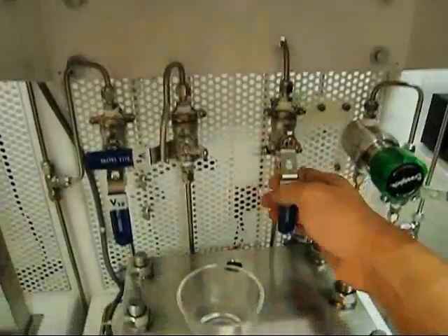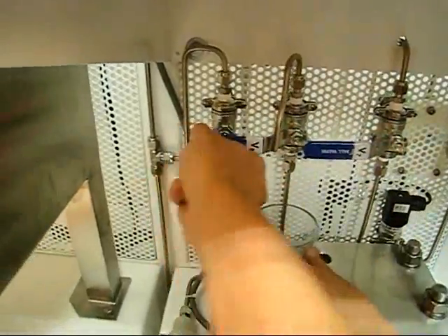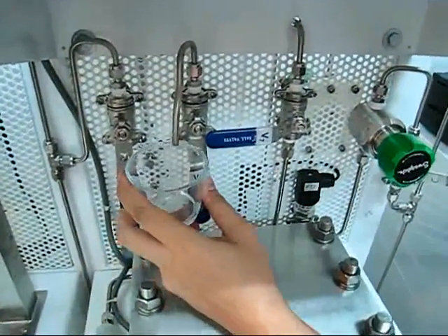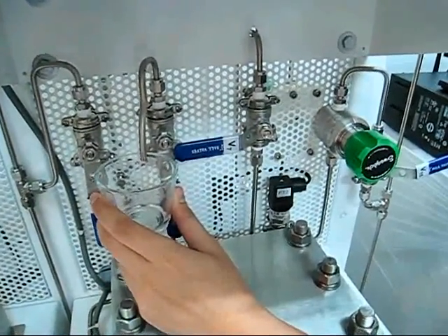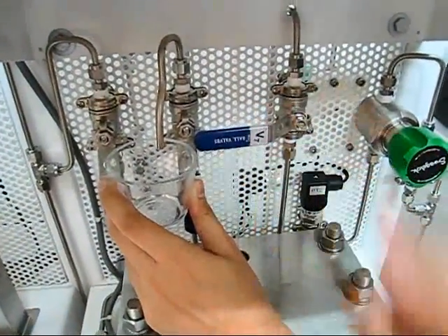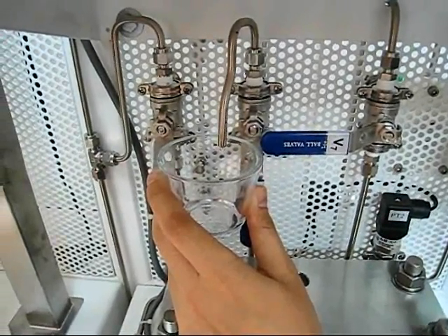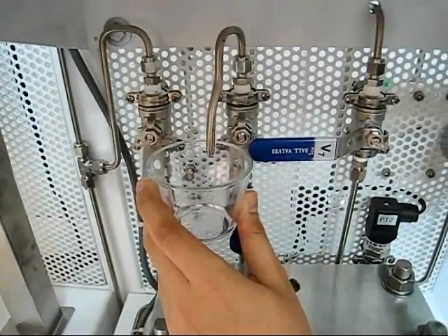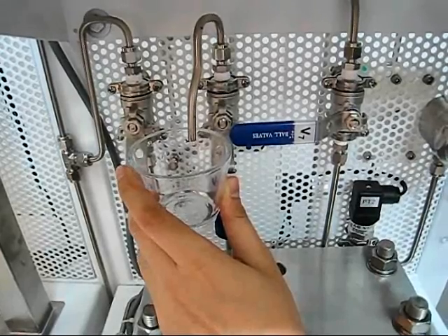I can do that by shutting off the permeate valve and opening the sampling valve. I should be able to get some permeate from the system right now. Here we go — it's dripping, dripping, dripping. Very slowly, I am getting some permeate from the membrane.